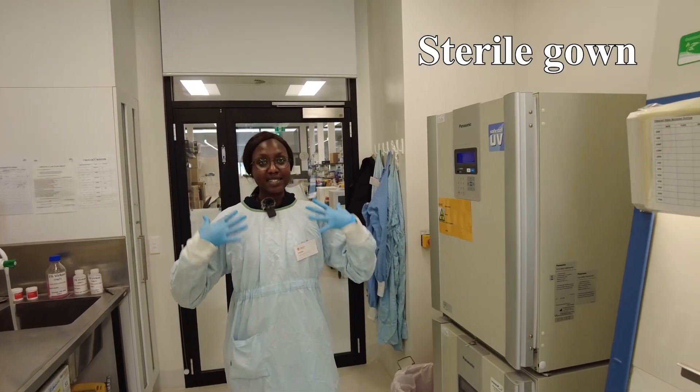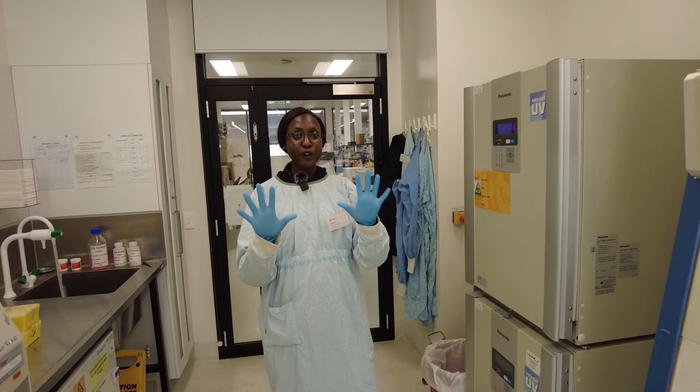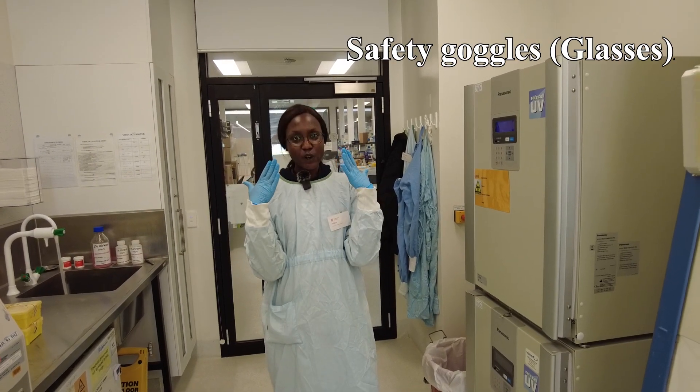The first thing you need is a sterile gown. You put it on at the front and tie it at the back, and then you put on your gloves and your safety goggles.